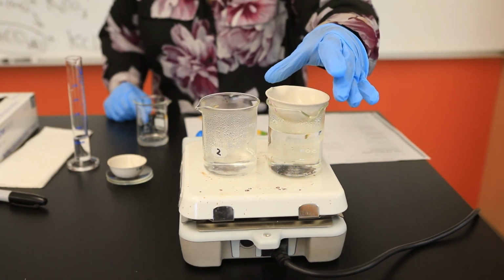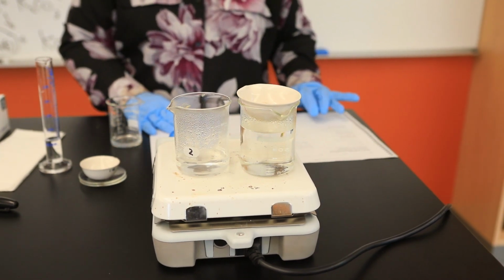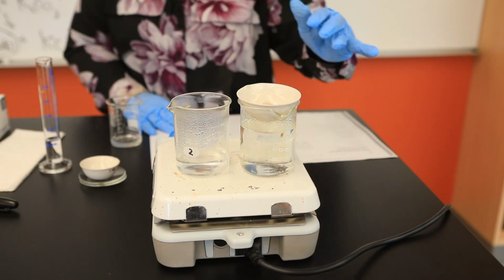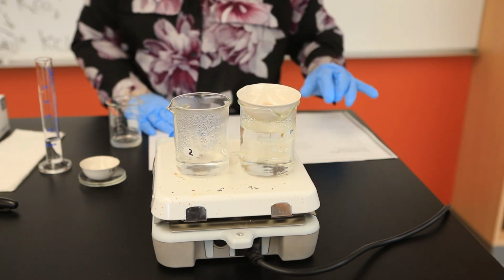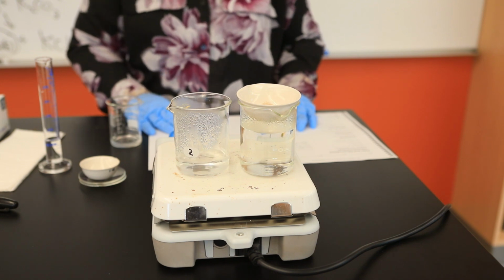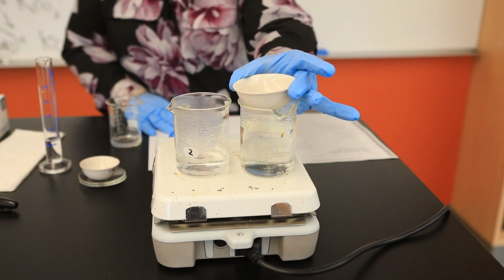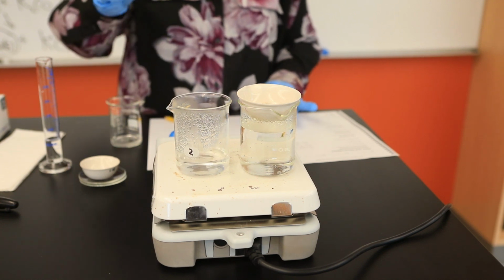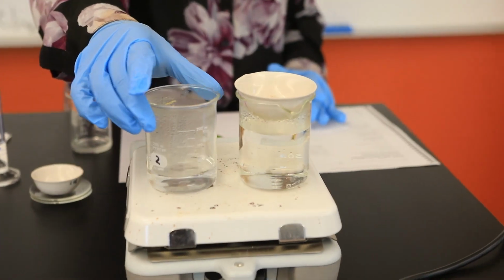Okay, so just to make sure that we're all on the same page, I need for you to take a few minutes and look back at your data sheet. And please do me a favor and record the mass of the empty container, the evaporating dish. So the mass of that evaporating dish is going to be 40.777 grams. The mass of that empty evaporating dish is 40.777 grams.